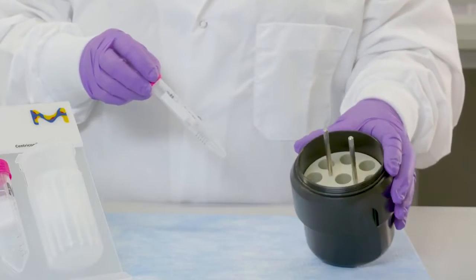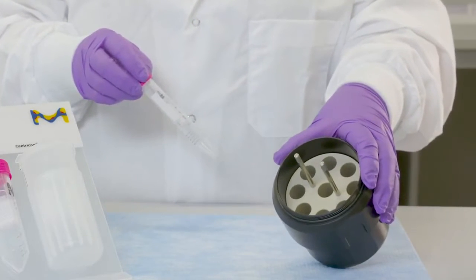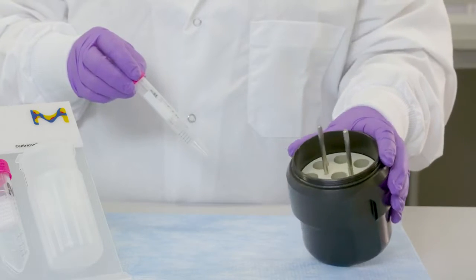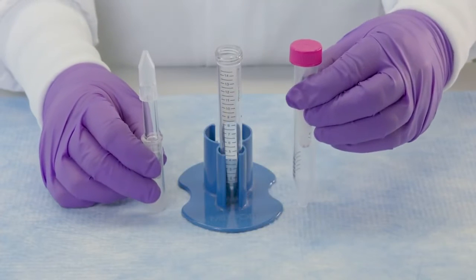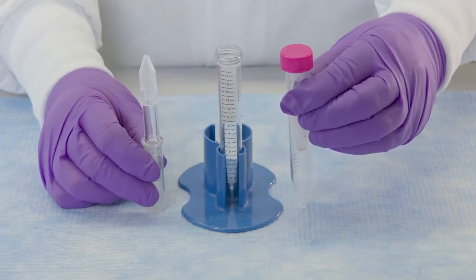The Amicon Ultra 15 uses a centrifuge with swinging bucket rotor or fixed angle rotor with wells and carriers that can accommodate 17 by 124 millimeter, 15 mil conical bottom tubes. Like the 2 mil device, the size format is similar to a standard 15 mil centrifuge tube.